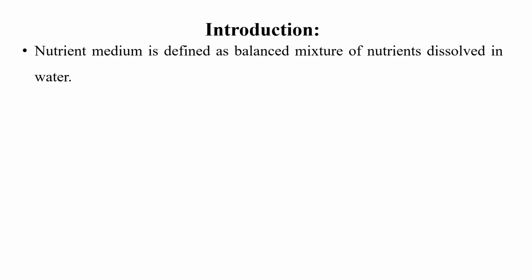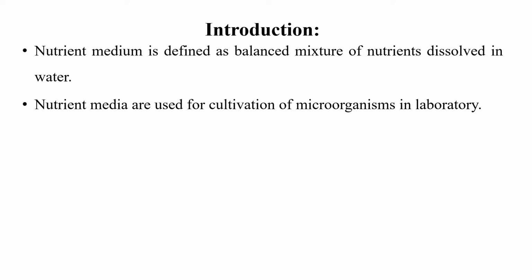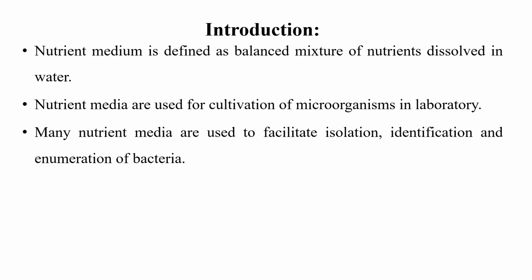So, nutrient media is a balanced mixture of nutrients dissolved in water. What is the need for nutrient media? They are most commonly used for cultivation of microorganisms in the laboratory. By using different nutrient media, we can isolate, identify, and enumerate or count the number of bacteria present within a particular sample.